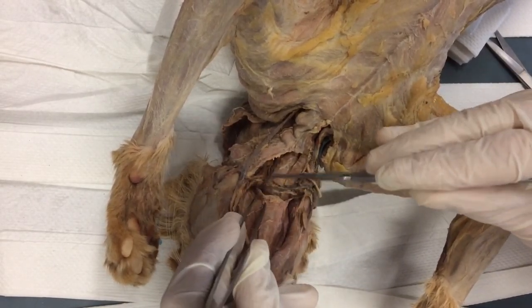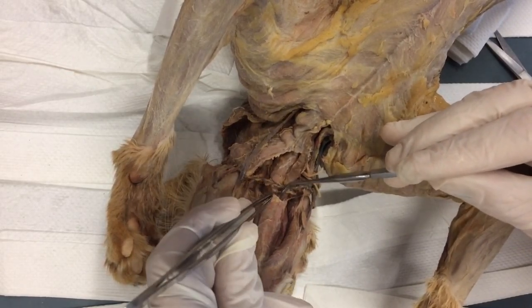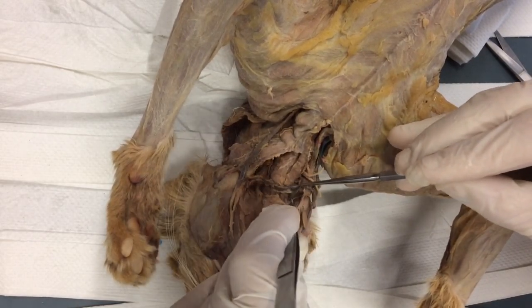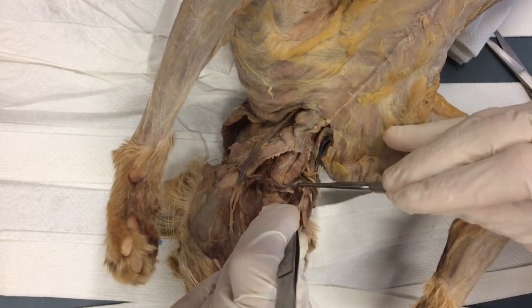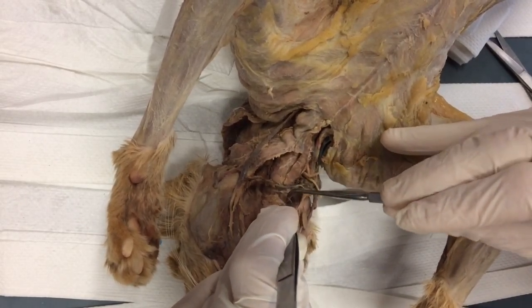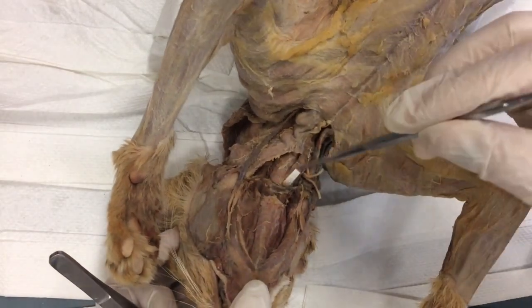All right, now on video, you should be able to see I now have this bottom margin completely separated. And I'm just using the round side here. Don't worry about damaging tissue down here around the hyoid bone. I'm not worried about it. Okay, so now that's completely freed up.